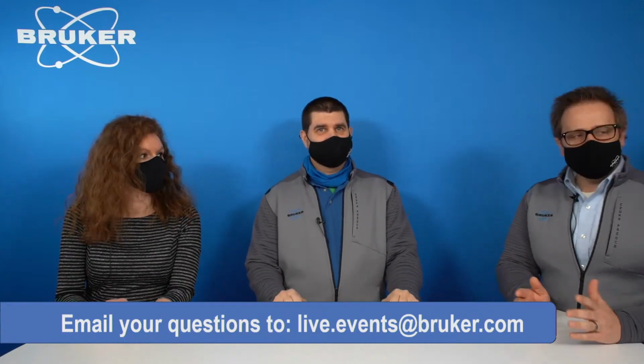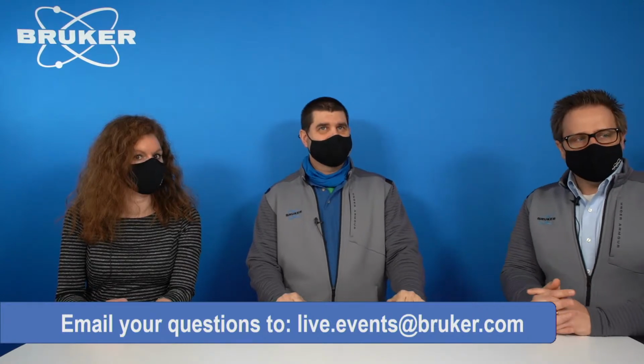So the first question comes from Melissa. What elements can you measure with WDXRF? Thanks, Melissa. That's a great question. We can measure with WDXRF anything from boron to americium. But with the S6 JAGUAR, anything below fluorine is not practical. Okay. So that's pretty much the whole periodic table. Yes, it is. In terms of, I guess you could say useful almost, right? Yes. Some of those higher ones, they only exist for like nanoseconds or something once they're created.